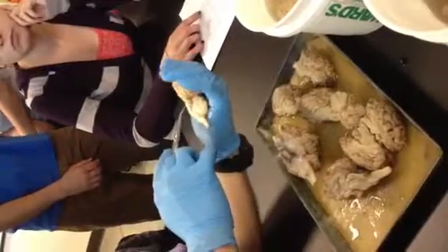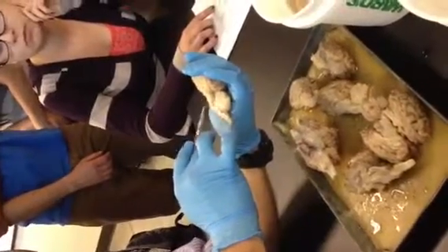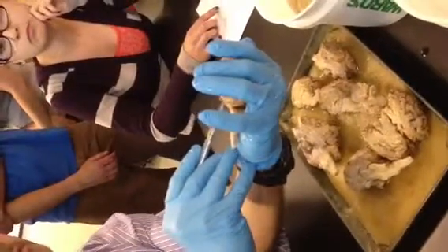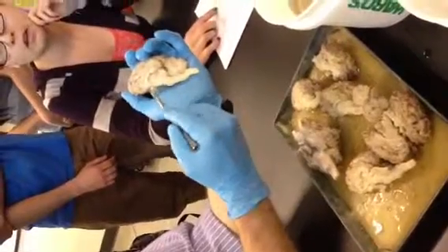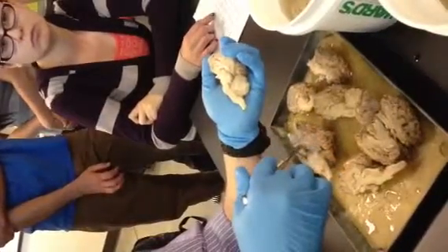It's all been removed. So you probably won't see it, but just know the infundibulum connects the base of the brain to the pituitary gland that sits kind of suspended right here. Okay? So the infundibulum is the stalk that connects the pituitary gland to the base of the brain.